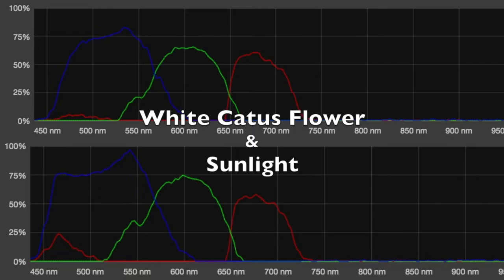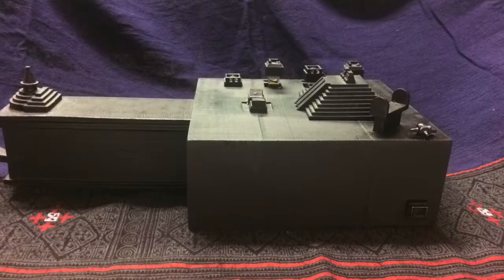Collected about a minute apart, we can see reduced data in the red and blue channels between 430 to about 575 nanometers. This has led me to question and experiment with growing plants in different wavelengths of light. In this aspect of my MESA Professional Development Program, I'm hoping to learn more about the hardiness of plants.